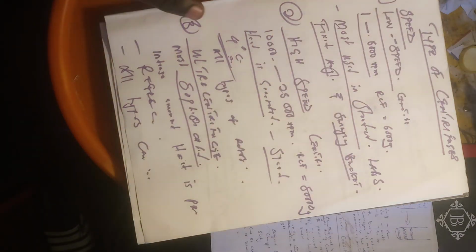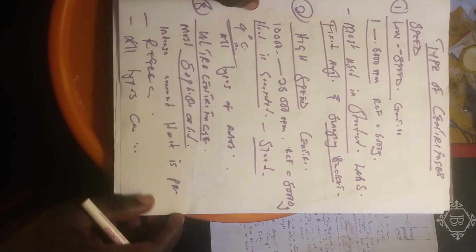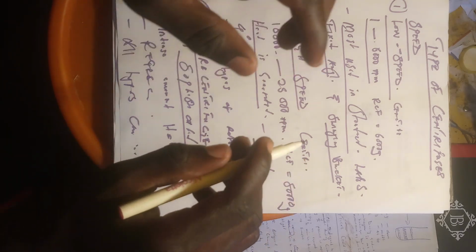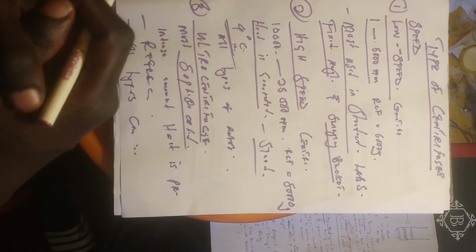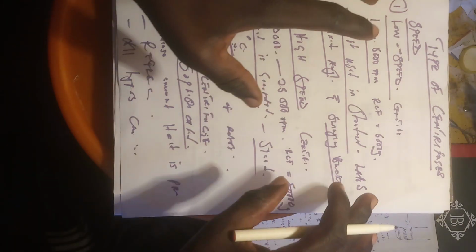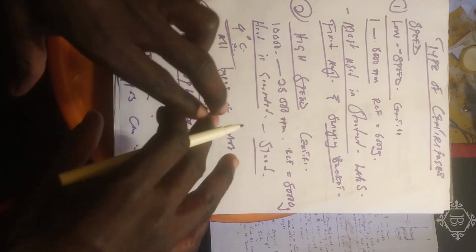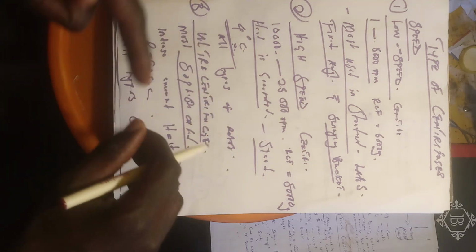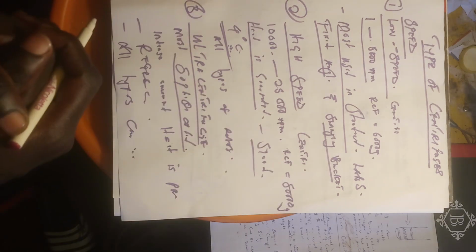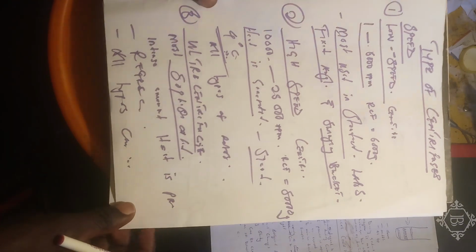And an advantageous point is that an ultracentrifuge can even isolate much smaller substances such as ribosomes, proteins, and viruses. Unlike the other centrifuges, this can isolate much smaller particles due to the high speed that particles are subjected to in the ultracentrifuge.